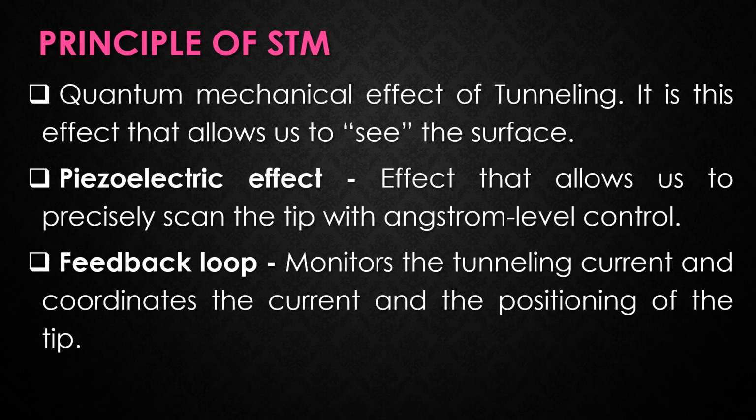The scanning tunneling microscope is a powerful instrument that allows one to image the sample surface at the atomic level. As the first generation of scanning probe microscopy, it paves the way for the study of nanosciences and nanomaterials. For the first time, researchers could obtain atomic resolution images of electrically conductive surfaces as well as their local electronic structures by using this scanning tunneling microscope.